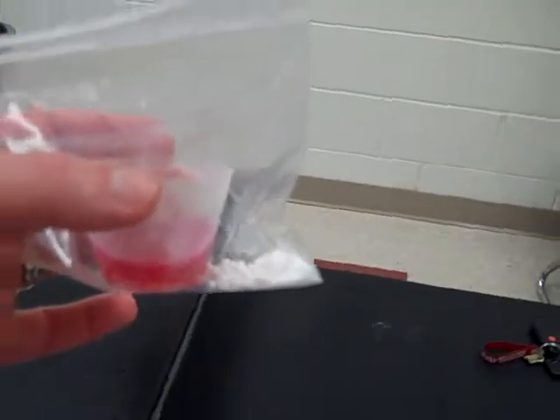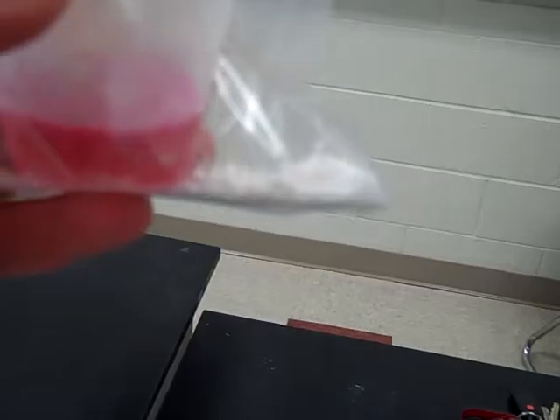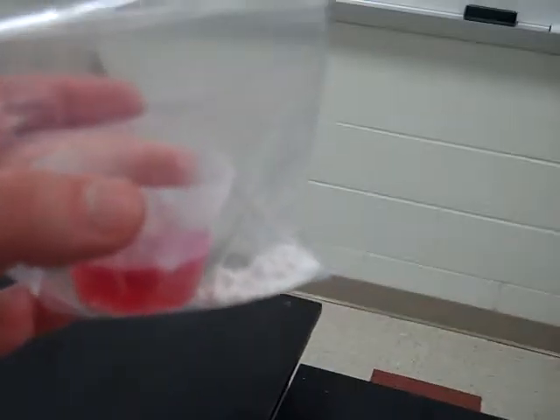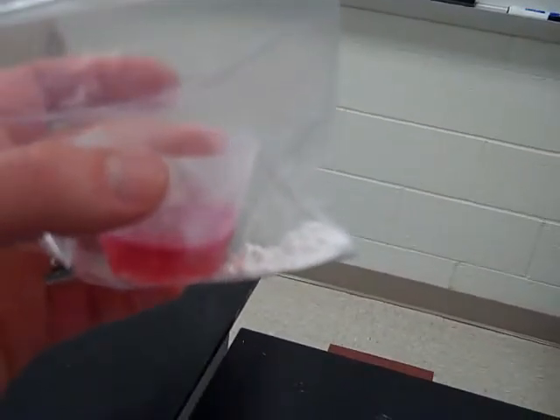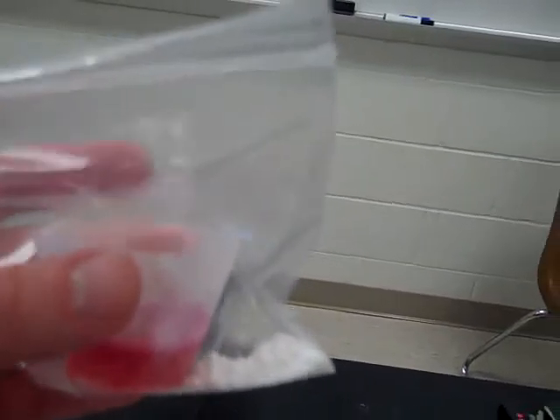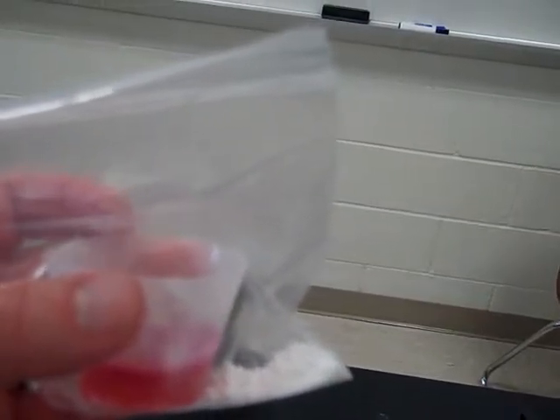Okay, this is station 8, the baggie experiment. What I did is I took equal amounts of baking soda, which is sodium bicarbonate, and added in calcium chloride, which is road de-icer. So those 2 contents have been mixed up here in the corner of the bag. And then I have a small medicine cup that contains phenol red, and phenol red is a pH indicator, so it will change if the pH changes. And what I'm going to do is dump the cup and mix up the contents.